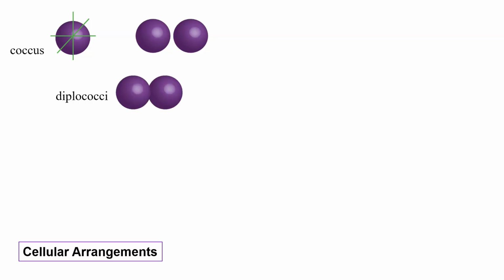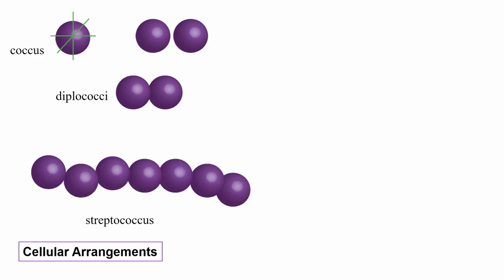One of the things we often talk about is cellular arrangement. In this particular case, if you look at a coccus, it can divide on one of 3 different planes. You call it an XYZ axis. If you get single division, we get single ones like that. You can have single ones where they kind of hold together, and we call that a diplococcus or diplococci. You can have them where they form together in chains, and we call that a streptococcus or streptococci.